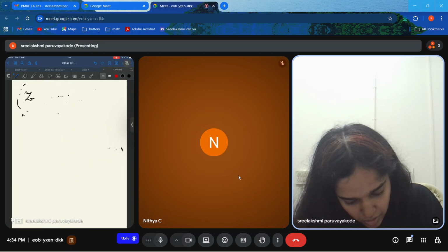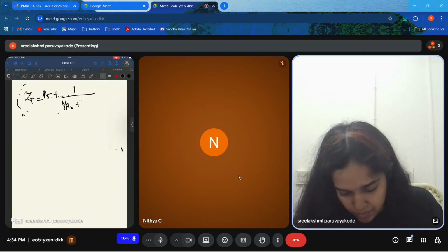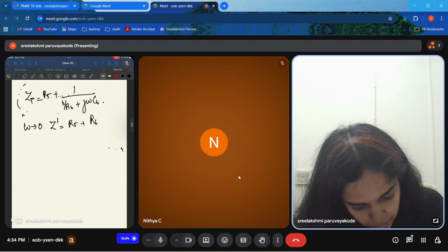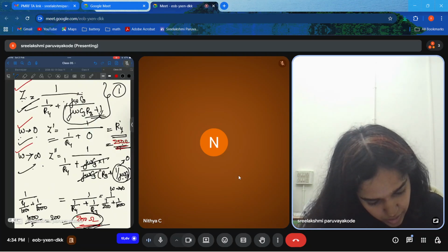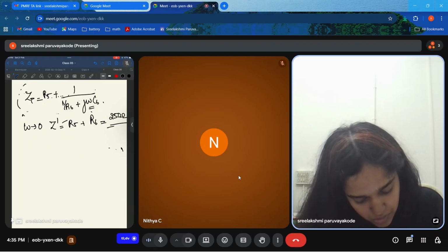So your equation is Z total equal to R5 plus 1 by R6 plus j omega C6. Now when omega tends to 0, how much does it become? R5 plus R6. Why? Because this term becomes 0 when omega tends to 0. So 1 by R6 becomes R5 plus R6. Now, what is the value when omega tends to 0 here? It is R4 equal to 250. So this is your first equation.